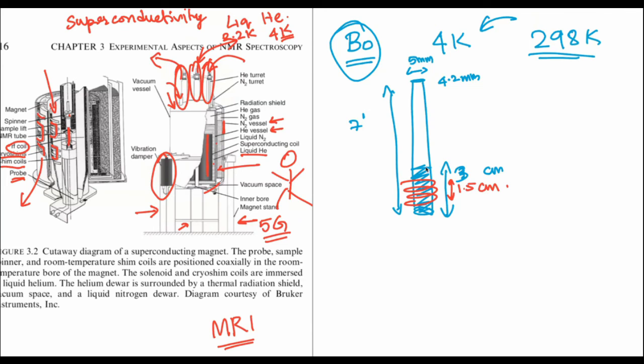Okay, so we will come to the aspect of why you need to have more sample than whatever is being acquired later. Once again, it helps in the fact that shims can be better done. So there you go. So that's the RF coil, and you're able to see the sample tube.